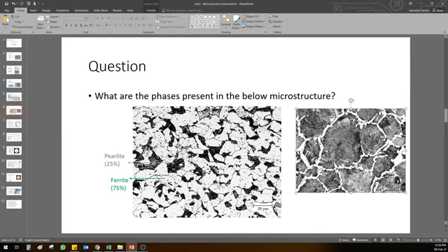When you have cementite, it will sometimes always come with perlite. Remember, cementite is also a little bit thicker line compared to grain boundaries. The black grain boundaries here are very thin, almost like a line, but cementite is like a broken thick passage, if you can see this. So this is how you recognize whether there is cementite inside or not.